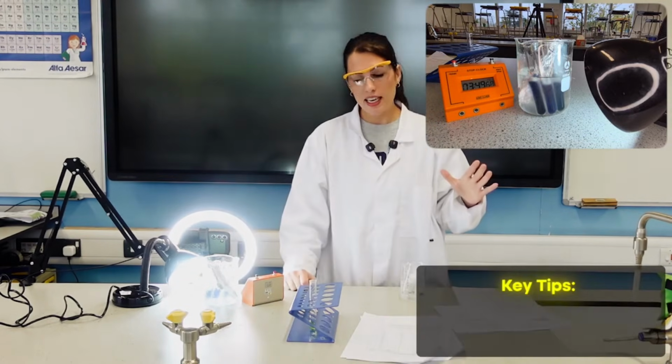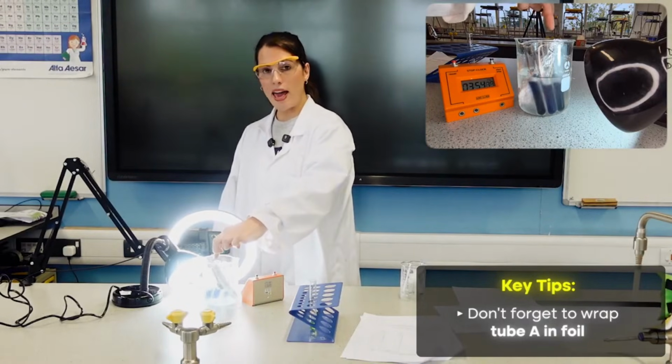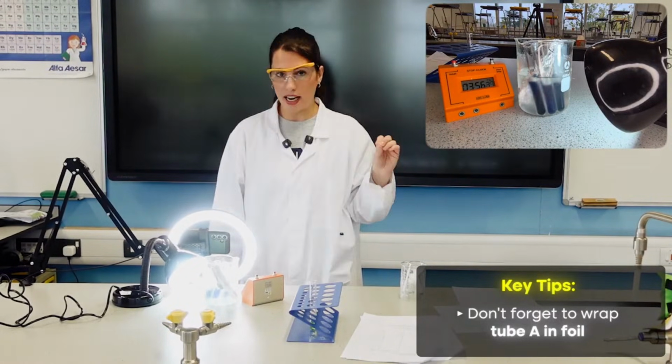But just some other key tips in general. So making sure students have fully covered test tube A, because that is our control where we don't want any light getting in.